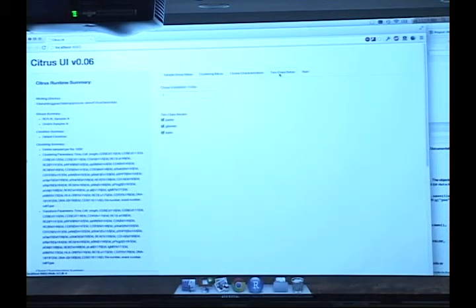And then finally, there are a variety of statistical models that you can use to detect the differences between these two groups. I'm not going to describe them here, but I will just say some of those are useful for identifying associations with continuous endpoints or survival time, whereas other ones are mainly focused on detecting differences between two or more groups.